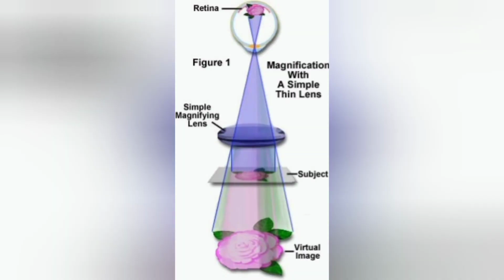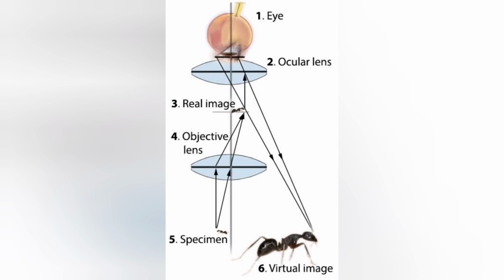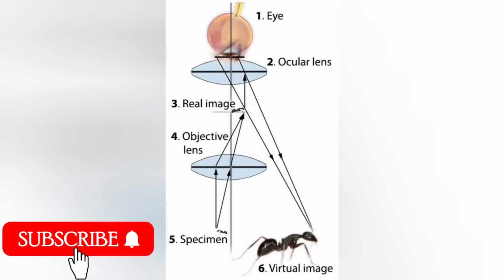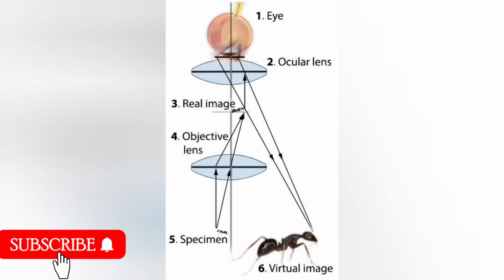Basically, what the microscope does is magnify the view of something. Anything that is on its point of focus, it magnifies it. It has two lenses that work together to create an enlarged image of a specimen placed under the objective lens, because it is the one closest to the object. Conversely, the lens closest to the eye is called the ocular. Microscope enlarges the view of an object by enlarging it twice using the objective and ocular lens.